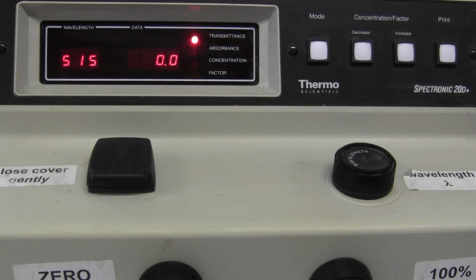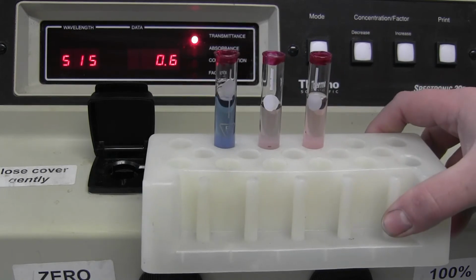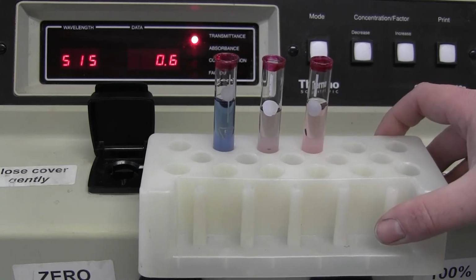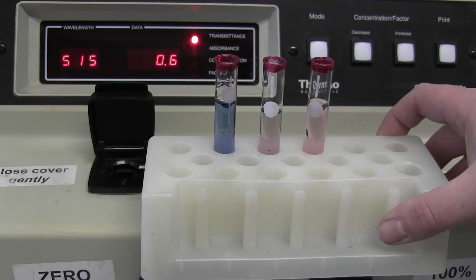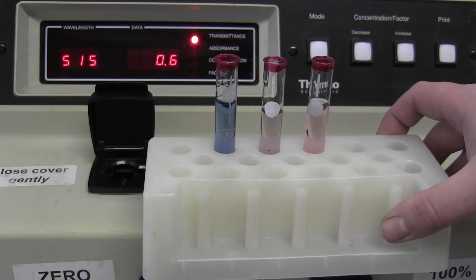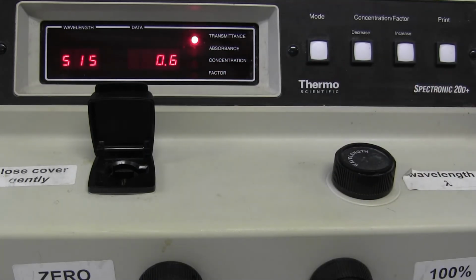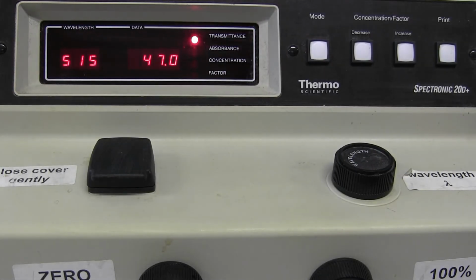With the instrument calibrated at 515 nanometers, you can now obtain the percent transmittance of each of your 3 samples, both at the raised temperature, room temperature, and at ice temperature. Throughout the experiment, you will be measuring using a thermometer what the 3 temperatures actually are. What is the room temperature? What is the temperature of your ice? And what is the temperature of your warm water? You will obtain the percent transmittance of each of these 3 solutions at 515 nanometers.